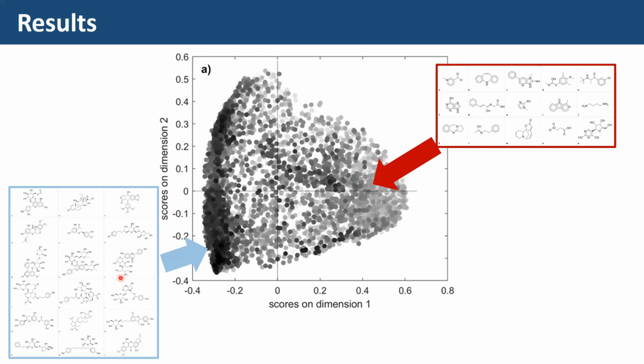On the left, you have more complex molecular structures. So our idea was that when you have a simpler structure, probably the fingerprint is more sparse: you have fewer activated bits equal to 1 in the fingerprint. And in that case, the neural network fails to learn from the data because you have very few activated bits.